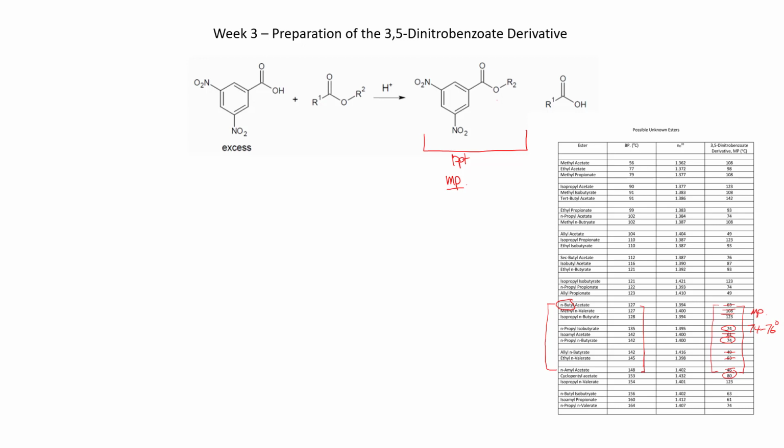Of course, we can now use our refractive index on the ones that are left to see which ones are good candidates. And so we would have measured the refractive index using one of the little refractometers.